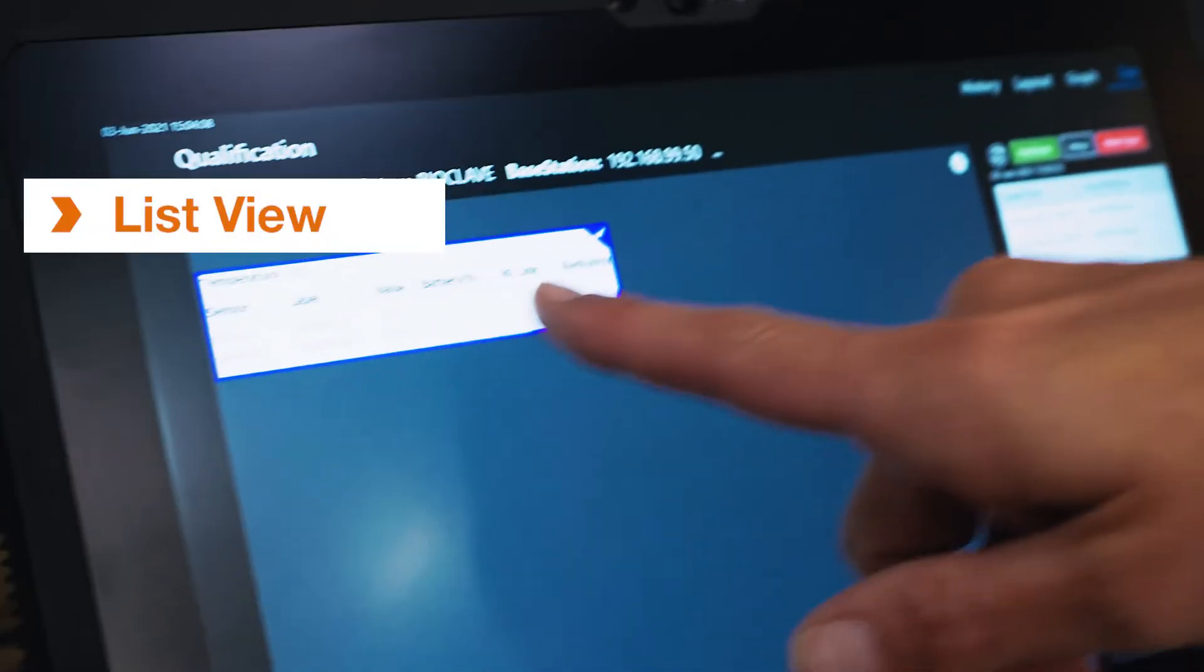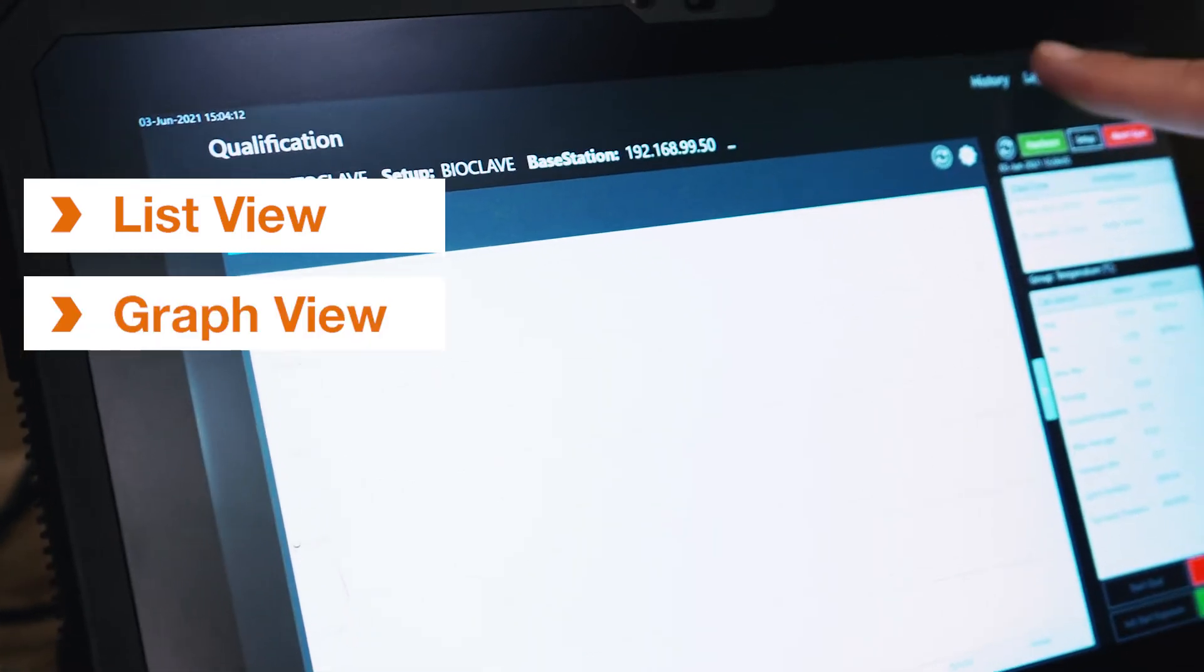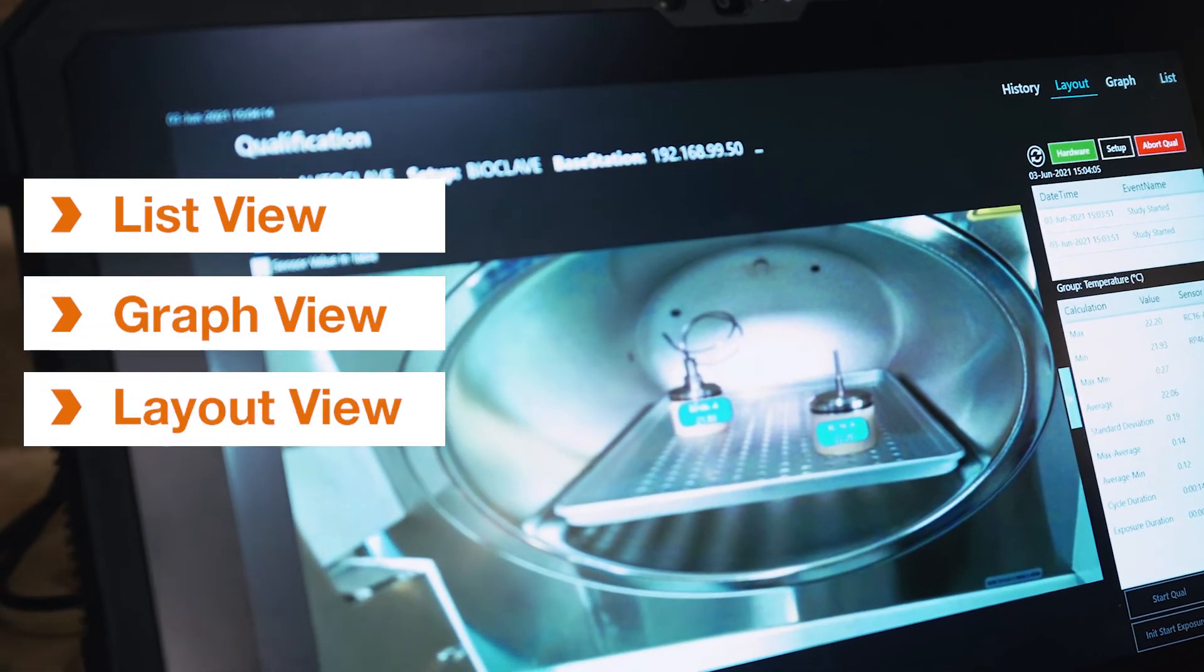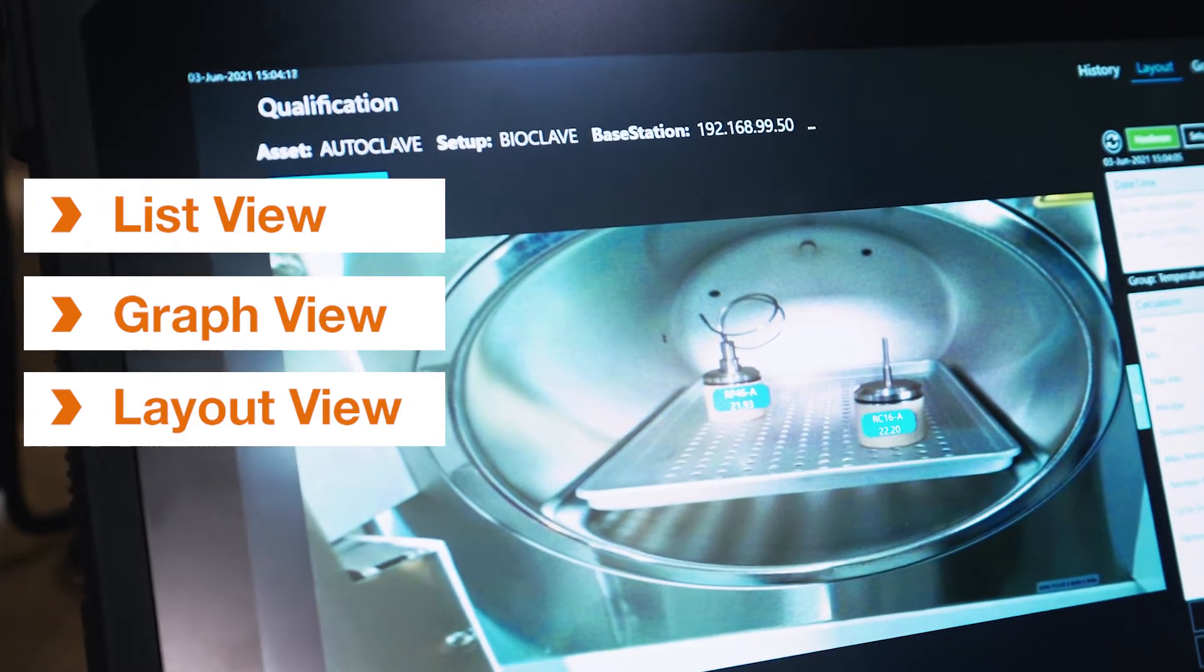I have my list view. I have the graph view. I have the layout view. You can see the two loggers. They have their serial number and the real-time data temperature that's inside.